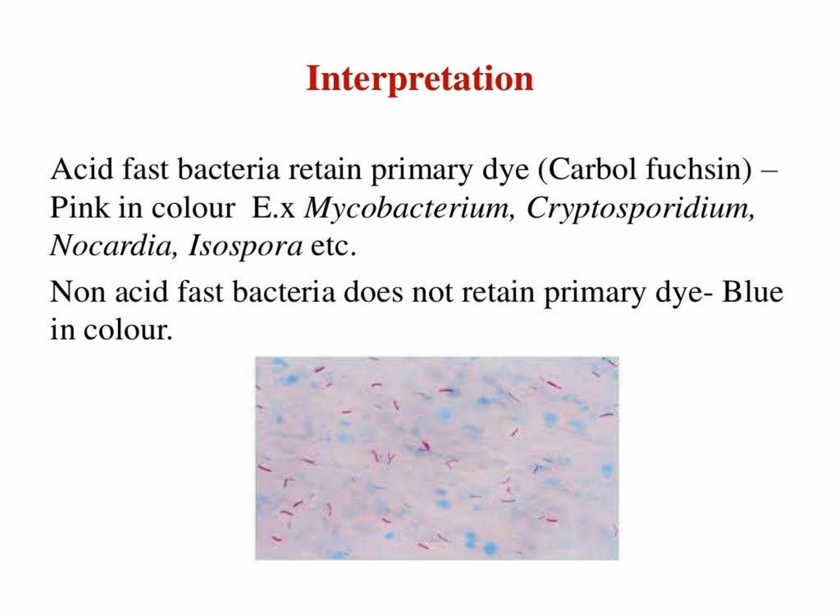Non-acid-fast bacteria do not retain the primary dye and will appear blue in color, as we said in the previous slide.